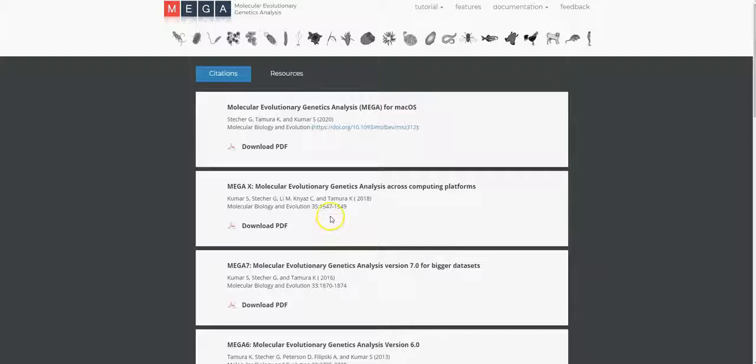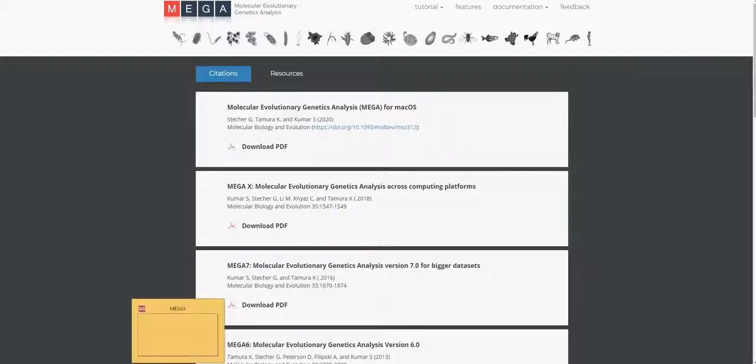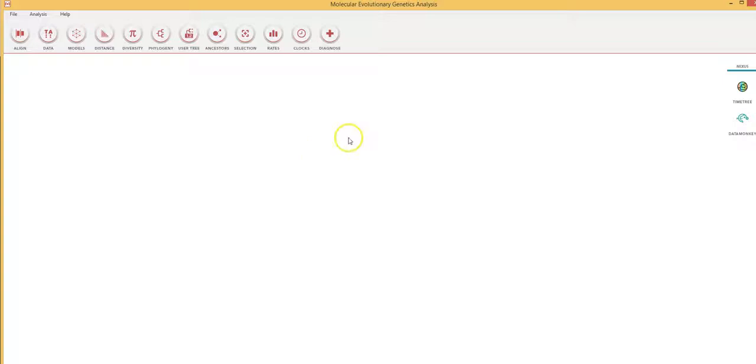Let's go straight to the software itself. The software can be downloaded and installed onto your Mac or Windows PCs.